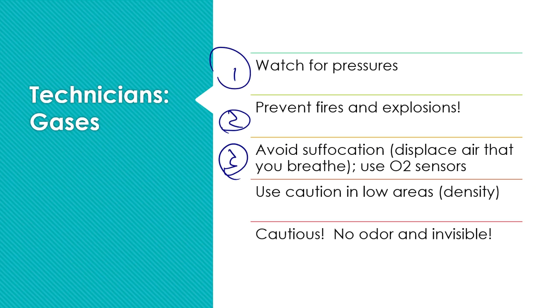Because of that, these areas will often use oxygen sensors. And if the oxygen goes below a certain level, then this is a warning. It's a sign that they can deliver to you to say, hey, something's up. Warning, warning, warning. You're going to suffocate if you don't do something about it, folks. So think of your fire extinguishers and your carbon monoxide detectors at your house. We've got sensors that detect oxygen levels, and if it goes below a certain level, then there's an auditory warning and very often flashing lights that happen with these sensors.